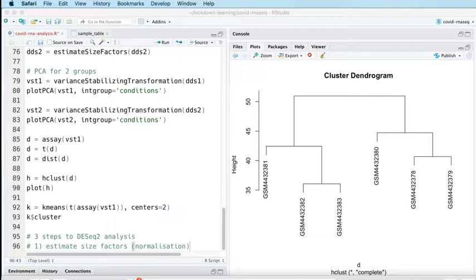Taking longer than expected. It always takes longer than expected, so therefore I think it just is expected. Okay, still loading. We'll get there eventually, promise.